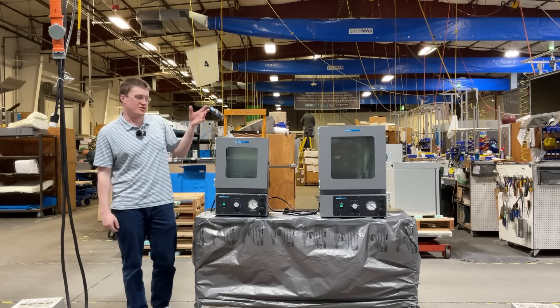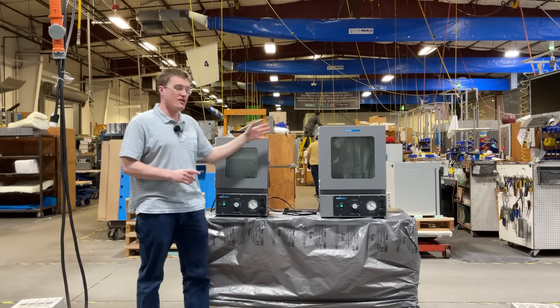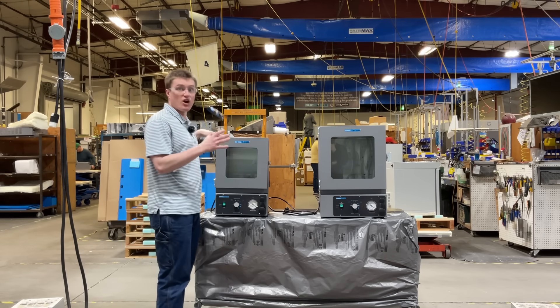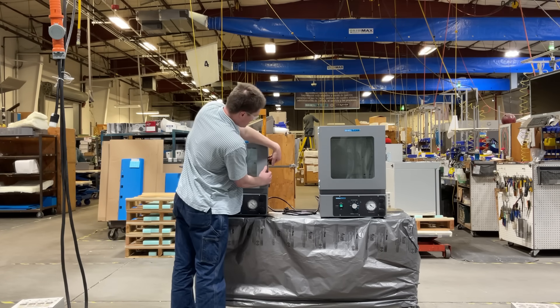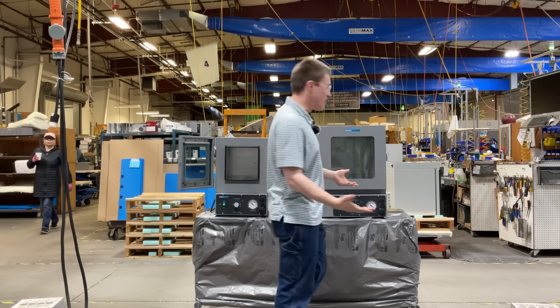Let's take a look inside both of these units. On the left, you will find the S-Vac-1E, which is approximately one cubic foot capacity. On the right, the S-Vac-2E, which is about two cubic feet. On both these units, which are identical outside of the capacity differences, the first thing you will see is the tempered glass viewing window.